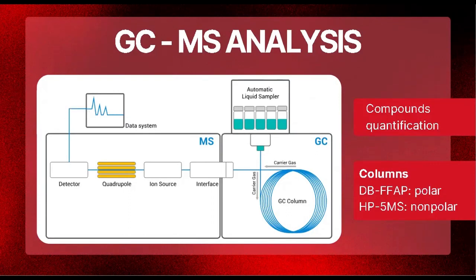The carrier gas was helium at a constant flow rate of 2 milliliters per minute, and the effluent supplemented with helium was split to the olfactory port installed at the back of the GC detector.